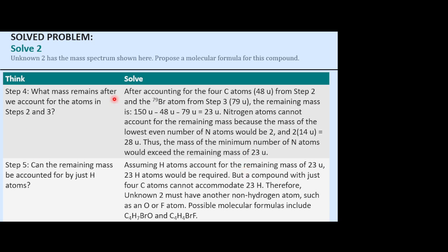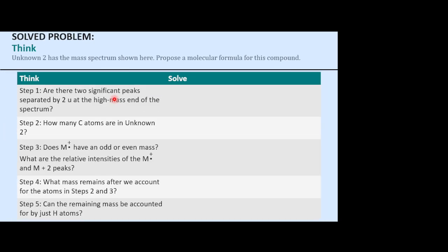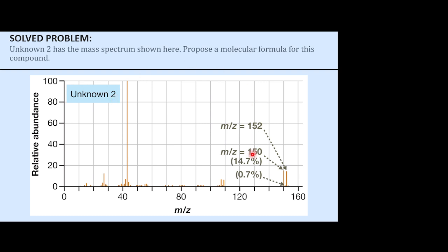I'm sorry, I'm confused. Isn't the drop between the 150 and those other peaks about 35, no? This one here? Yeah, but that has the double peak. That would be a chloride or bromide. I get that, but wouldn't that make more sense to be a chloride then? No, because this drop here still has the chloride. That's what you'd be saying, that you're dropping 35 by not removing the chloride. You're not removing this double peak.